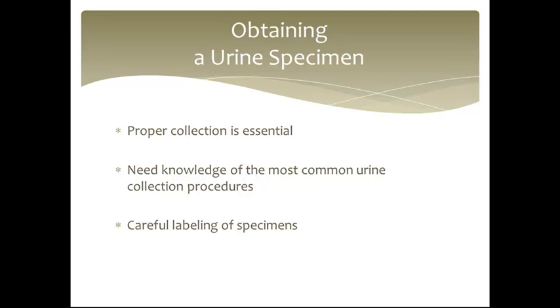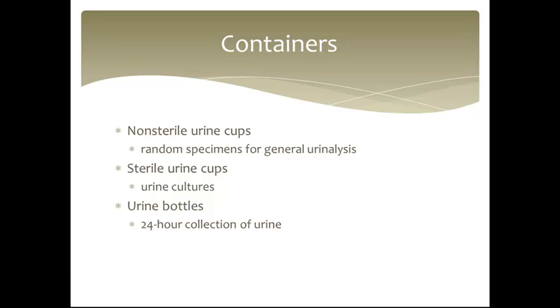Obtaining a urine specimen, so proper collection is essential. You also need knowledge of the most common urine collection procedures. And careful labeling of specimens is very important.